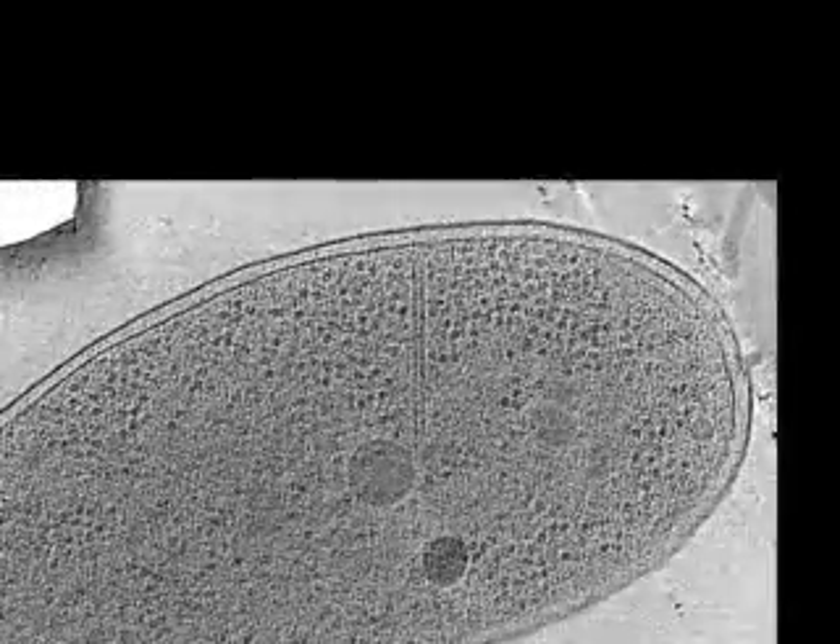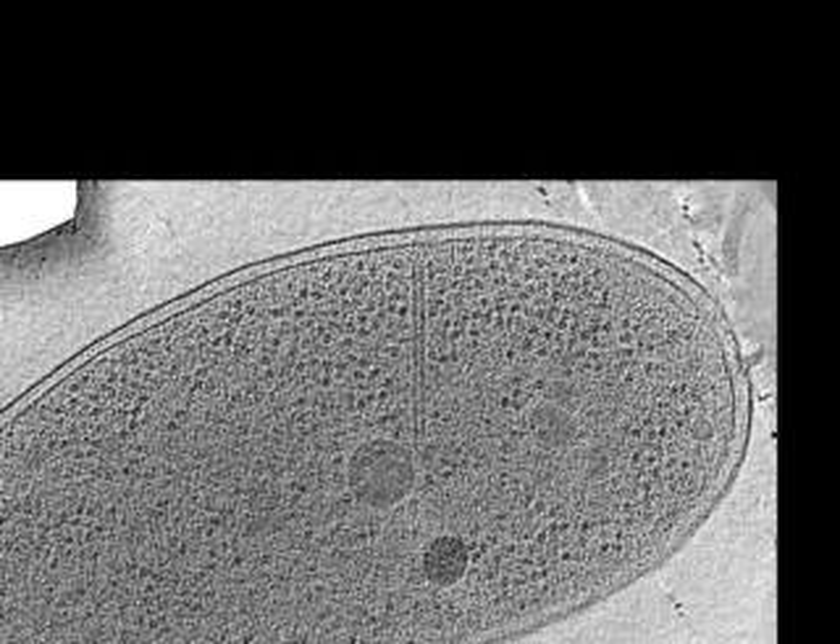Here is a 3D reconstruction of another Vibrio cell exhibiting an empty sheath in its contracted conformation. Compared to the extended conformation, contracted sheaths were shorter, had a larger diameter, and had a helical surface pattern. Here you can see a central slice through a contracted sheath.